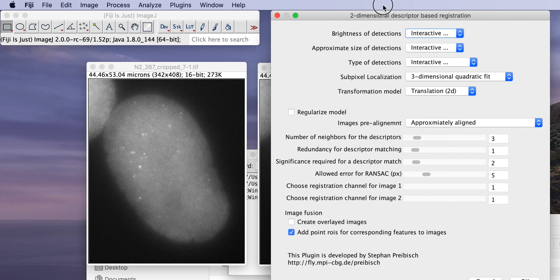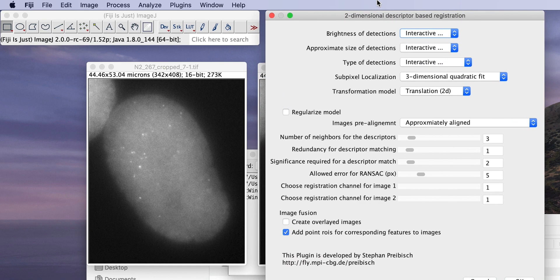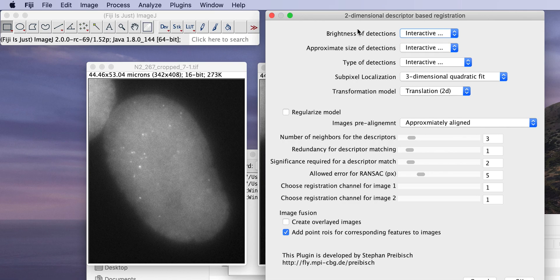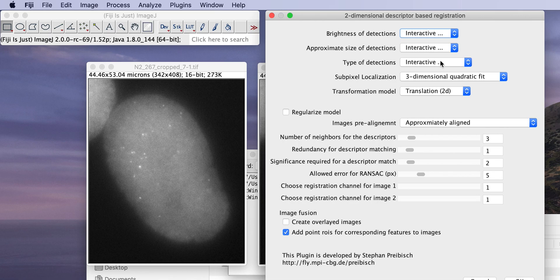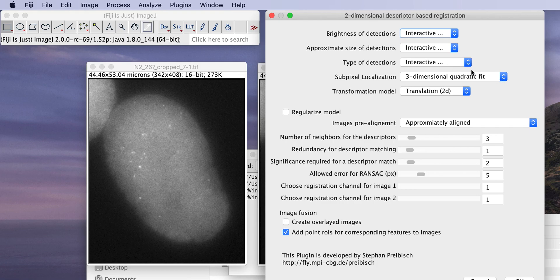And now it asks us a few sets of parameters. So the first one is the brightness of detections, approximate size of detections, and type of detections. So for now we have to do this interactively because we don't really know it yet, right? However, for macro recording we later on have to run this whole thing again then knowing the parameters that we actually want to put in. So we have to record this twice, but it's also how you will most likely have to do it in your case.